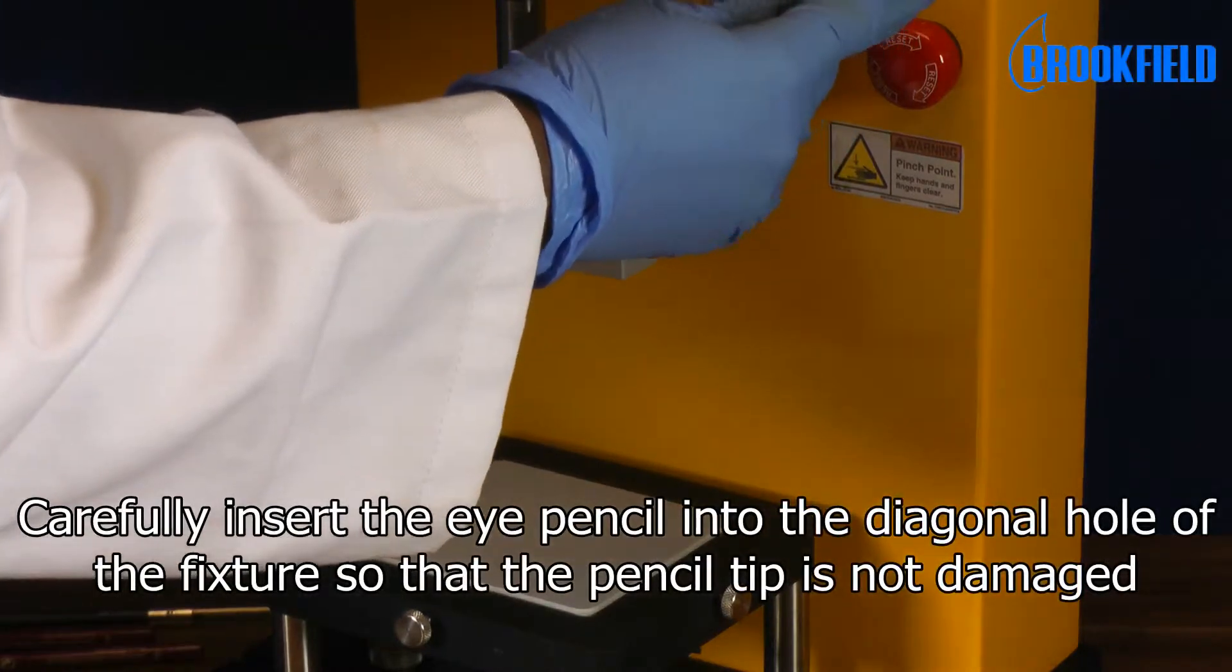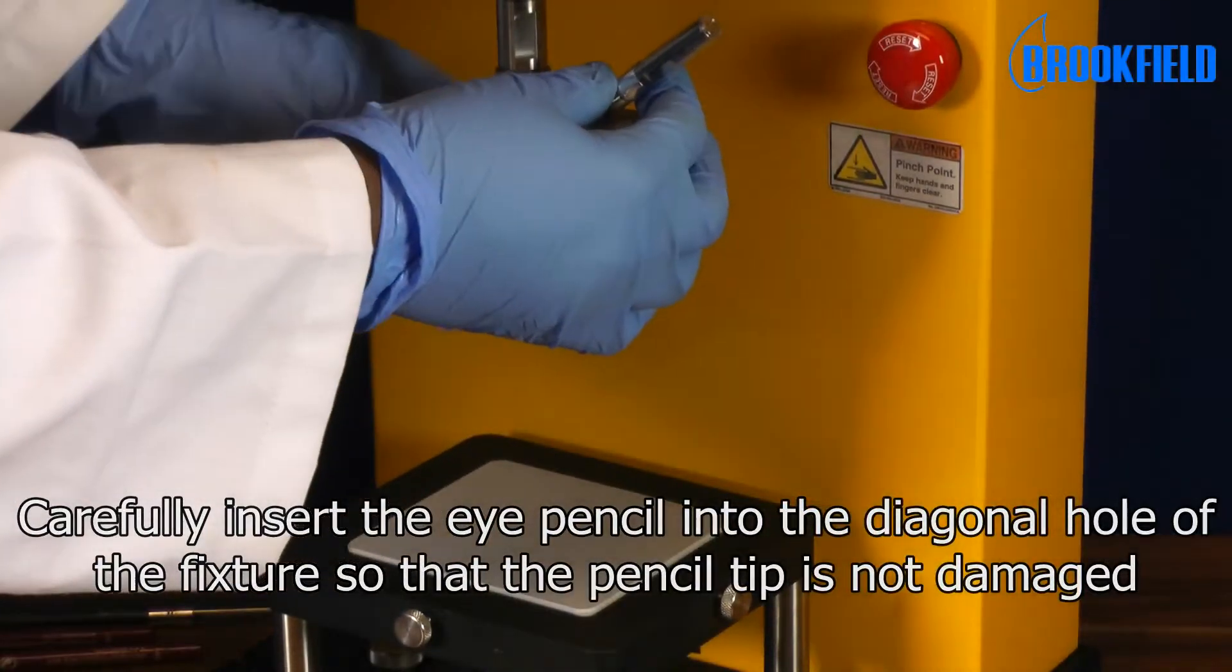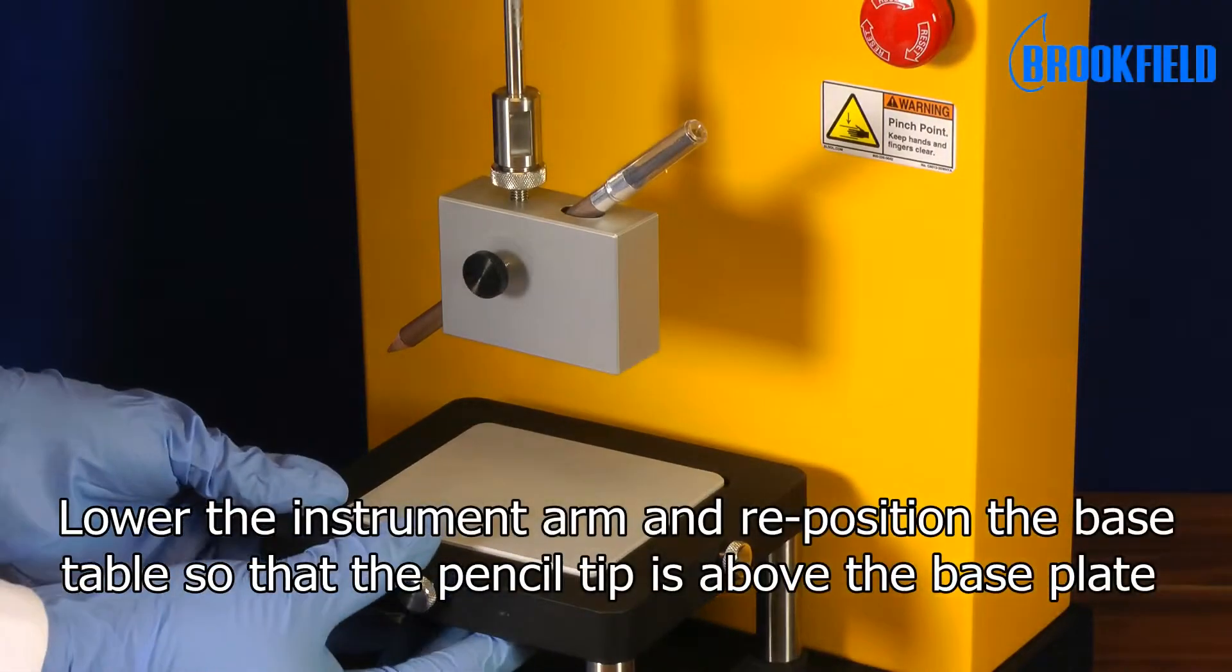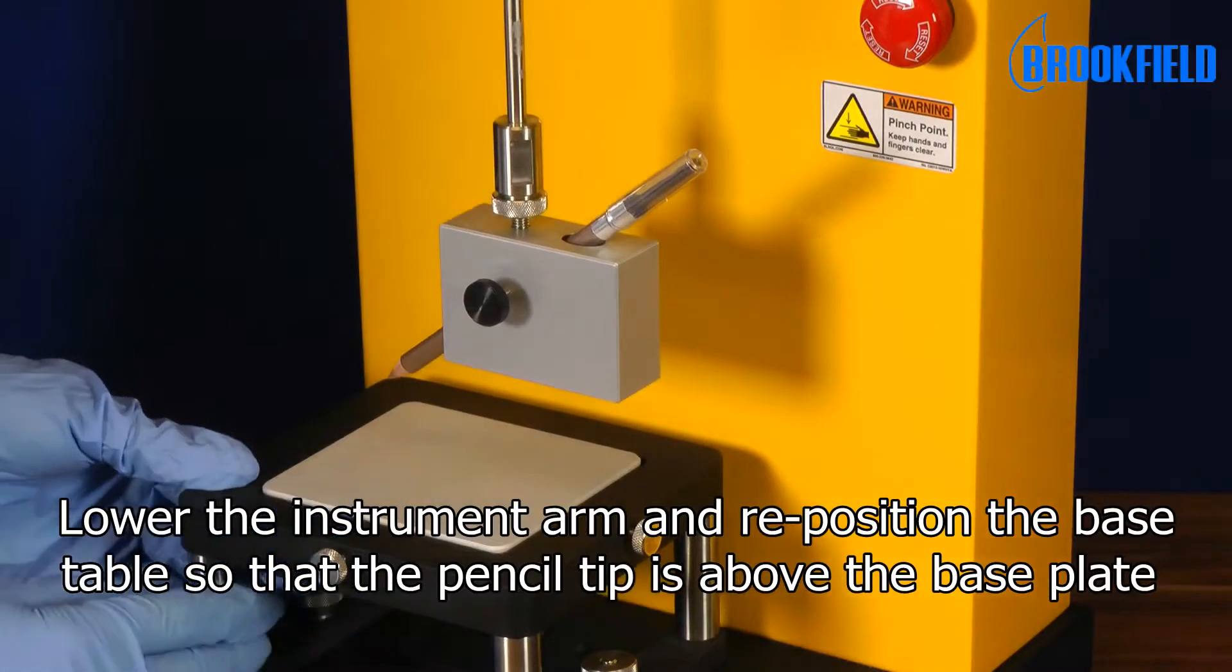Carefully insert the eye pencil into the diagonal hole of the fixture. Lower the instrument arm and reposition the base table so that the pencil tip is above the base plate.